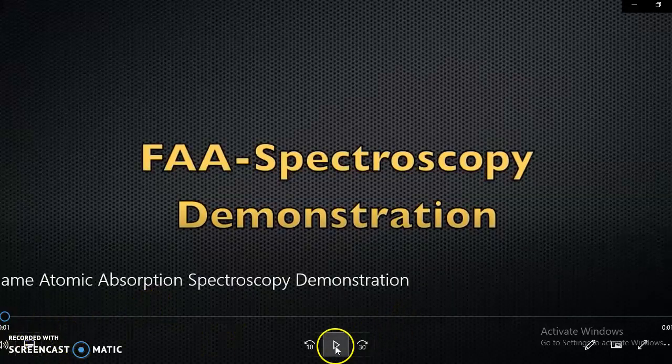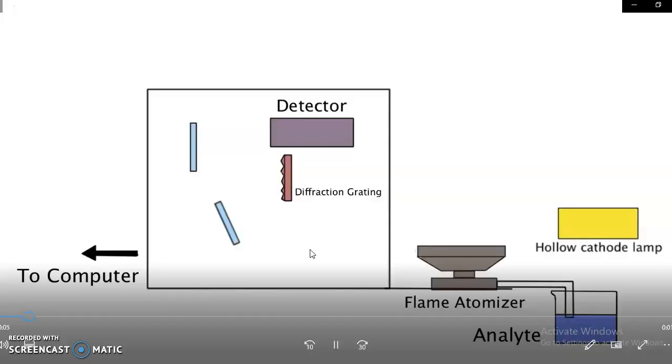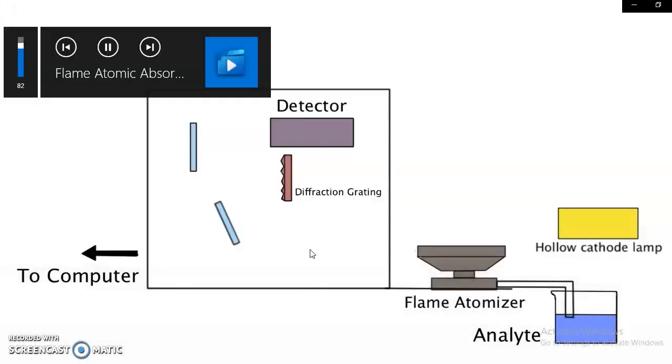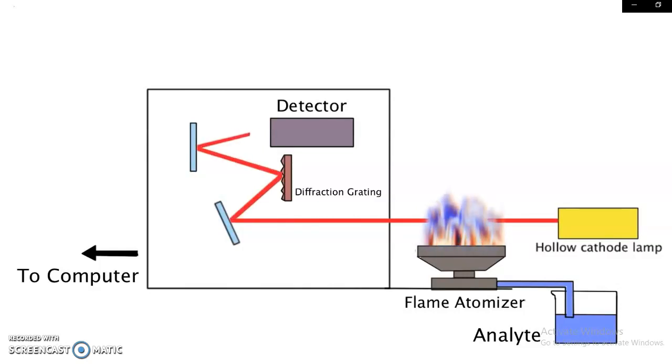This This animation of a flame spectrophotometer will provide an idea of how the machine works. The analyte is taken into the nebulizer where it is vaporized and conditioned to provide the best sample for the flame. The radiation source sends light through the flame and into the monochromator. In the monochromator, the beam encounters a series of mirrors that separate the beam from any background light and noise that is not necessary for analysis. This filtered beam finally hits the detector, which relays the data to the analysis software.